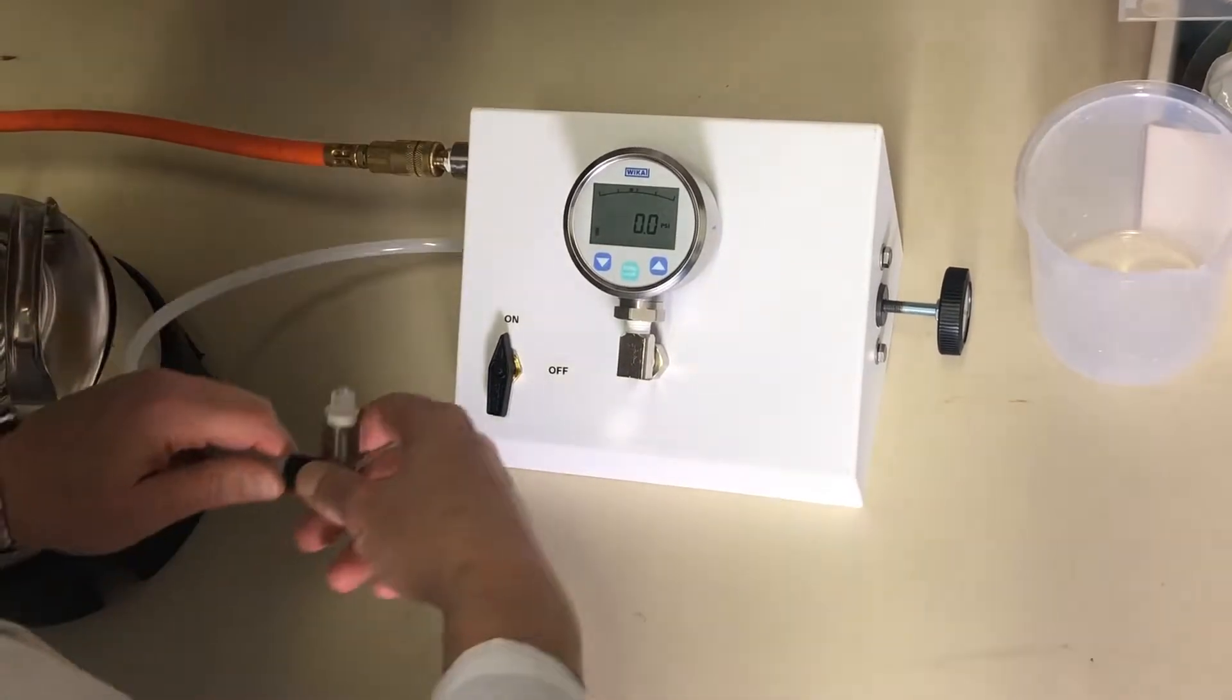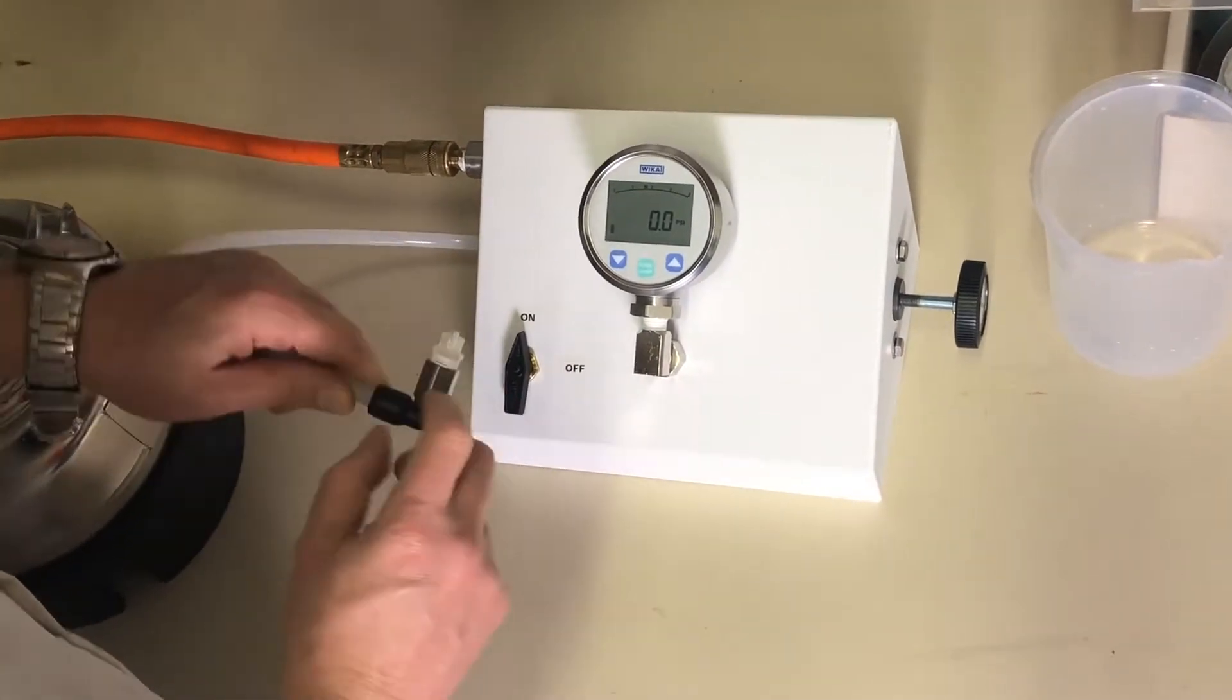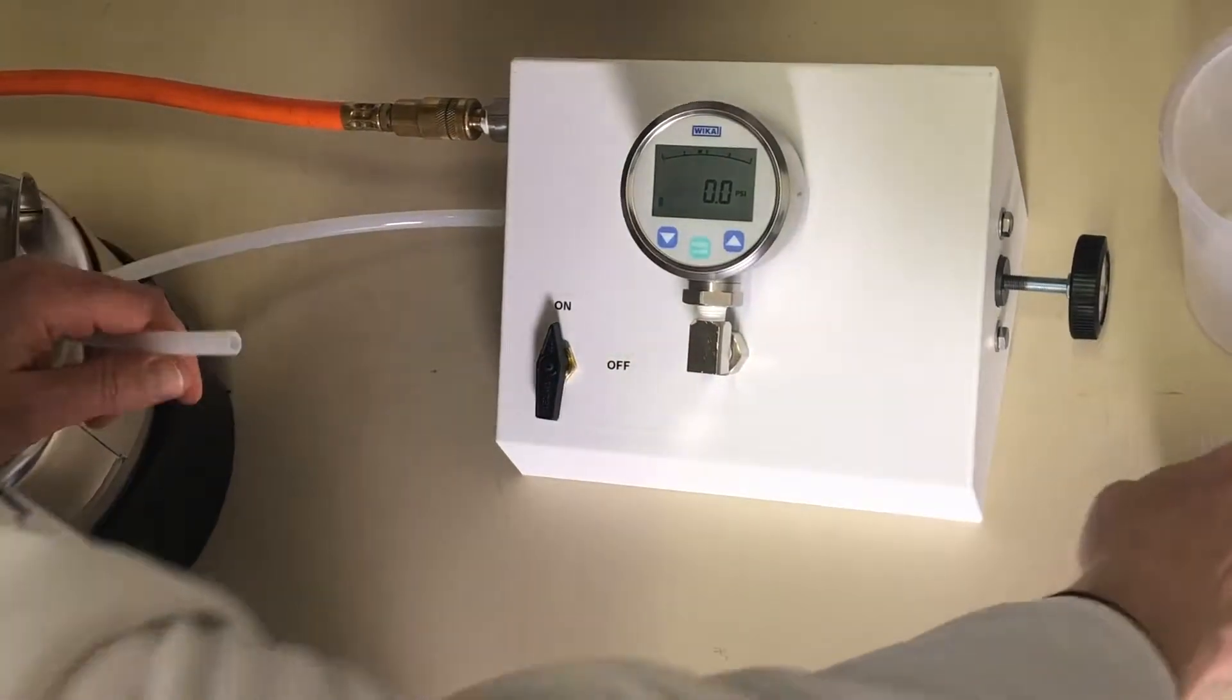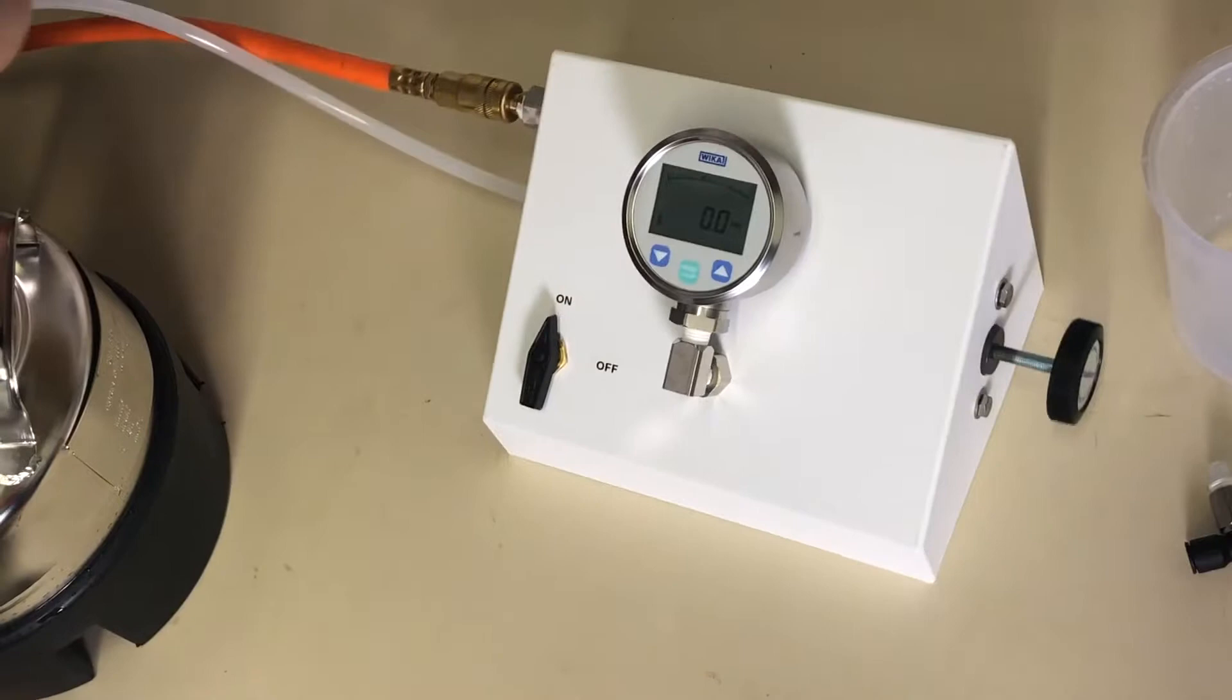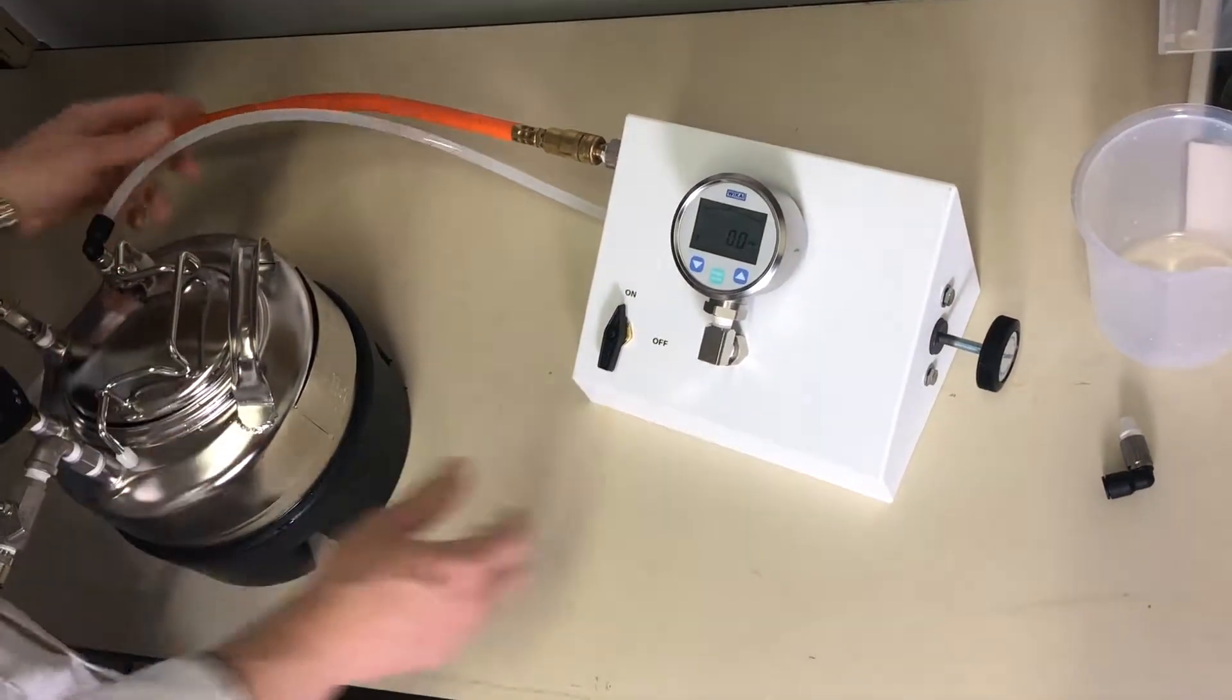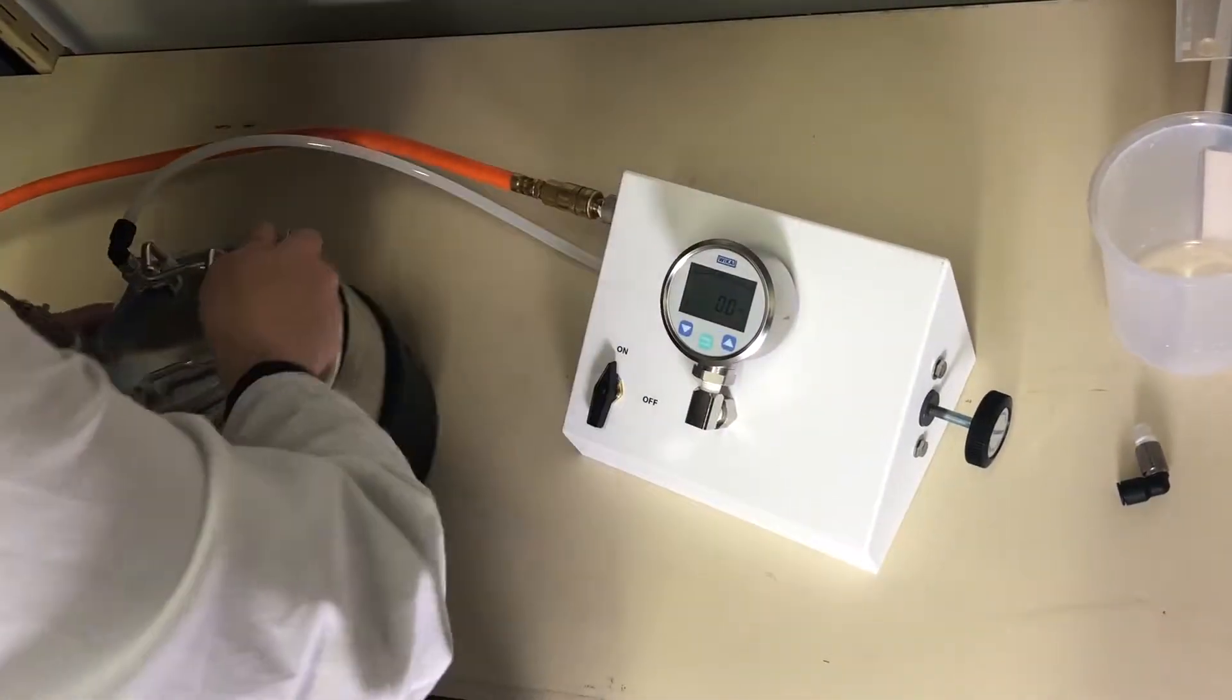We'll disconnect the test fitting, push down on this flange and the hose pulls out. We'll connect to the pressure pot just by pressing, we are ready to go.